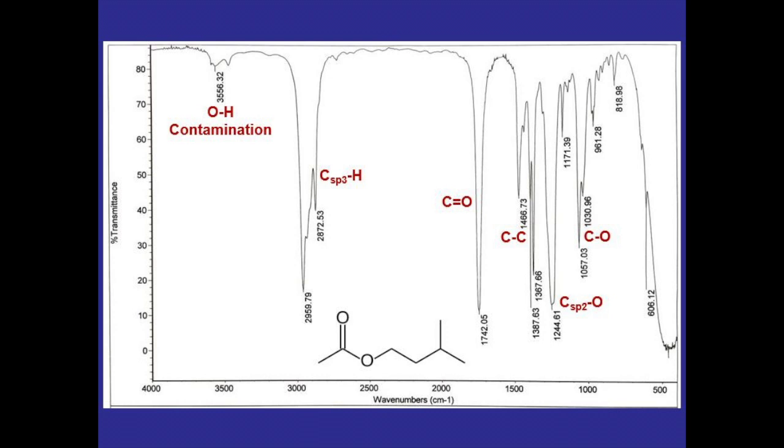And that's it. That is how we run IR spec in this lab, and this is how you should label each of the IRs given to you for each of the experiments.